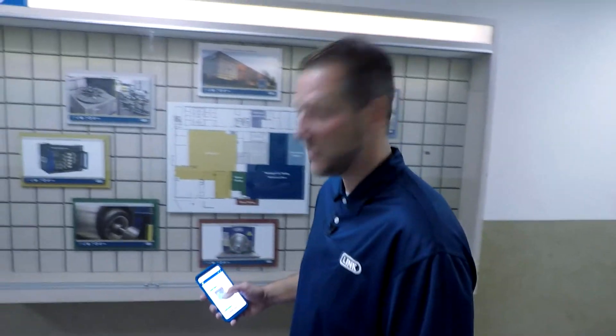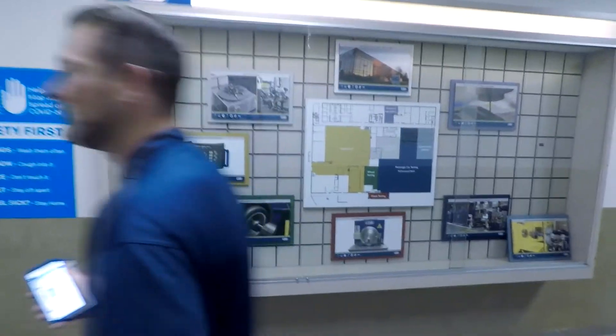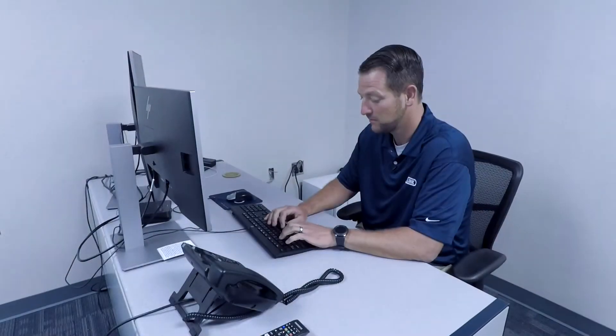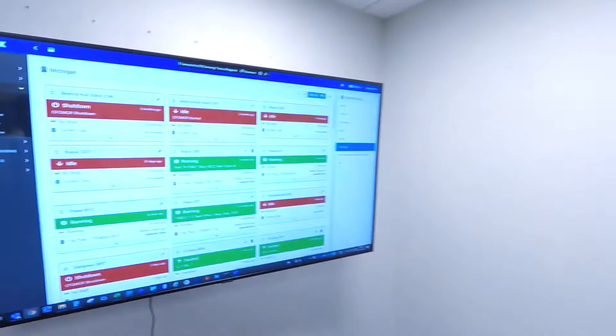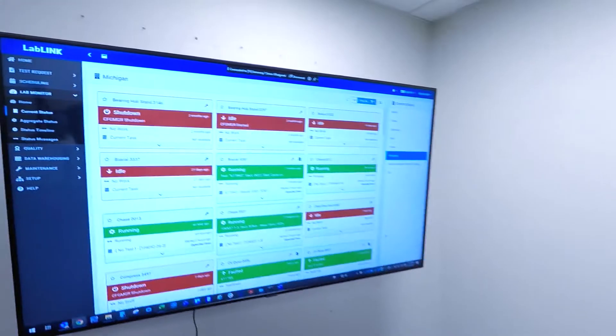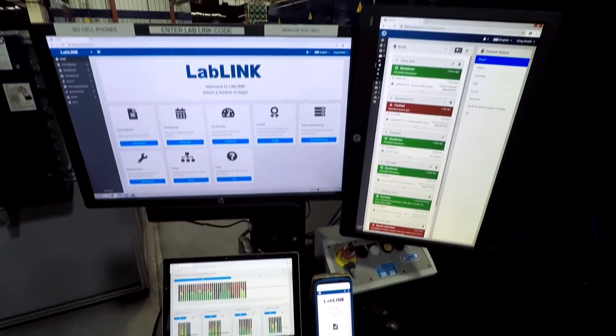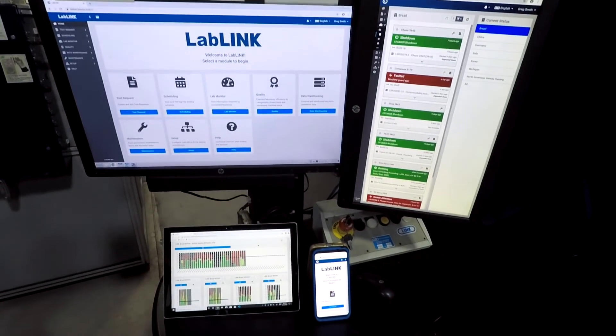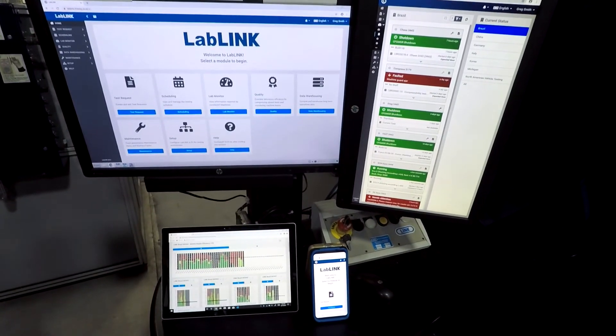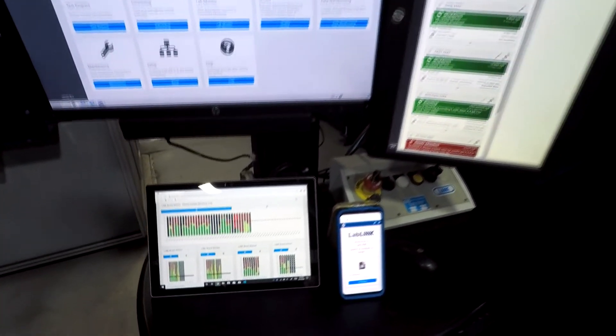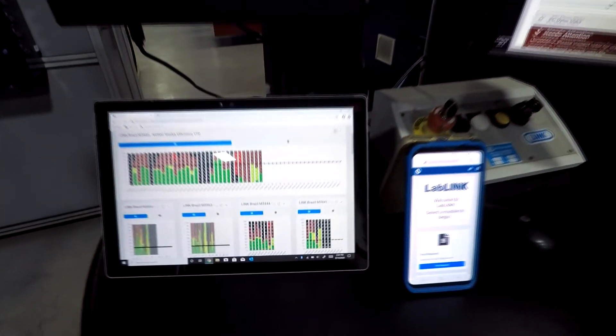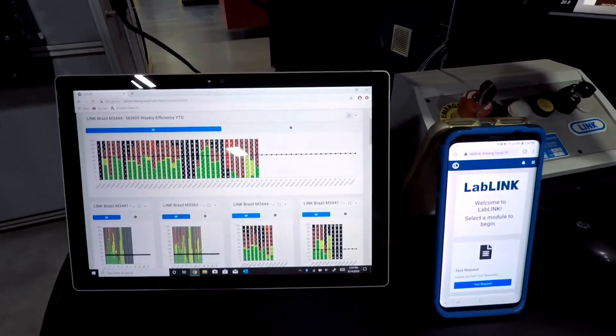LabLink is a browser-based web application that provides convenient access to any facility on any device anywhere. With automated notifications and alerts, LabLink reduces unnecessary communications, allowing you to focus your attention on what matters most to your organization. LabLink provides multi-platform access to the information you need when you need it.